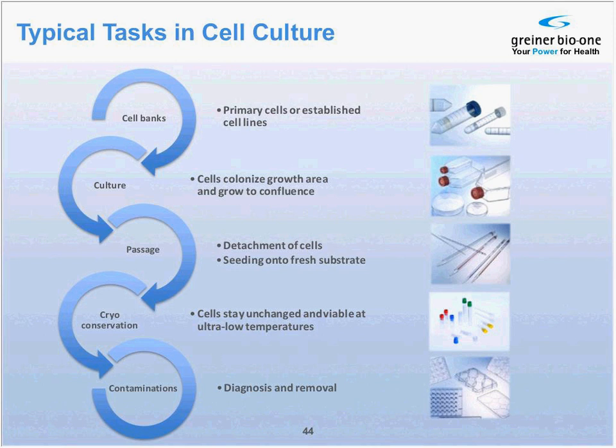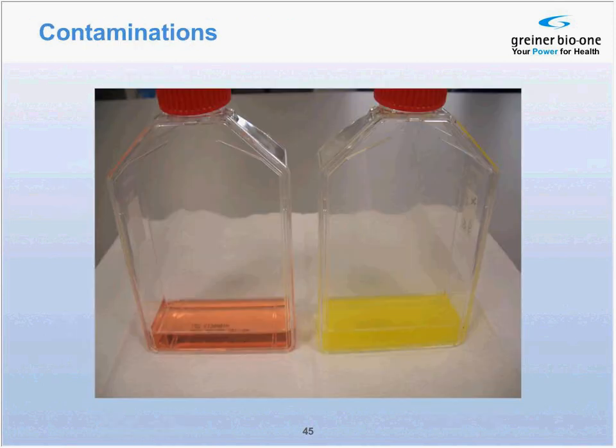As the last part of my talk today, I would like to spend a few minutes on the diagnosis and removal of contaminations. Probably everybody working in a cell culture lab has faced this scenario at least once. After opening the incubator in the morning, the phenol red indicator in the cell culture medium has turned yellow, turbid, and cells are either dead or severely affected by a contamination.